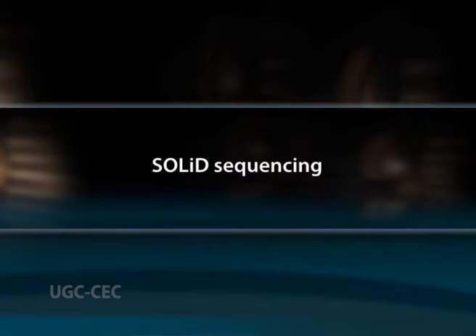The next method is SOLiD sequencing. The technology for sequencing used in ABI SOLiD sequencing is oligonucleotide ligation and detection. In this, a pool of all possible oligonucleotides of fixed length is labeled according to the sequenced position. The sequencing provides better results compared to Illumina sequencing.